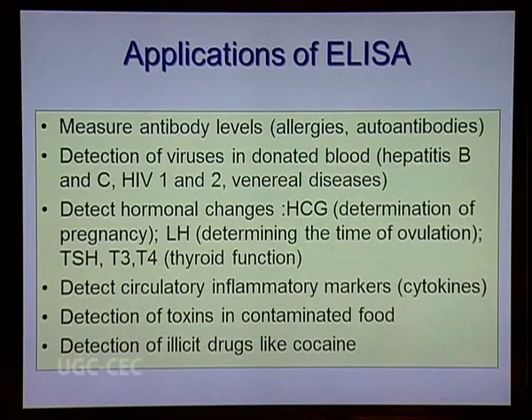Also we can detect the thyroid hormones very easily through ELISA. Also we can detect the presence of toxins in contaminated food or the presence of cocaine in blood. So ELISA has multiple applications.